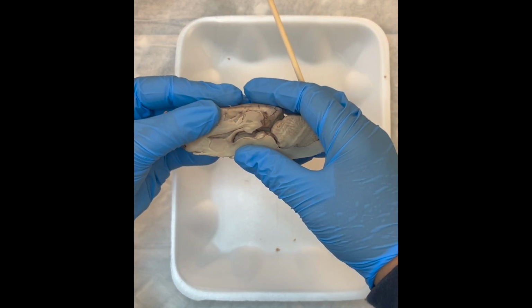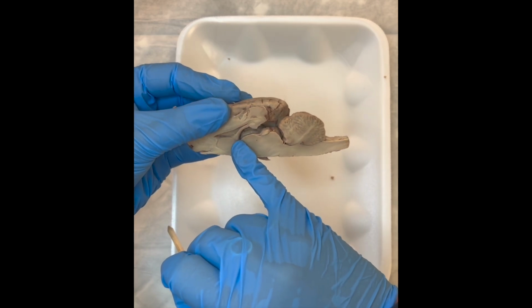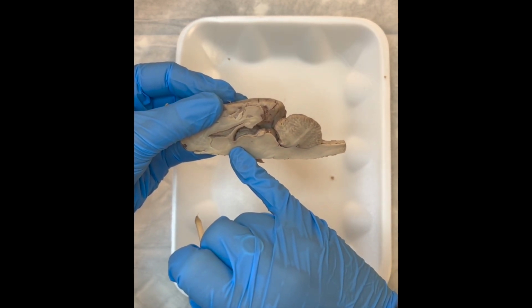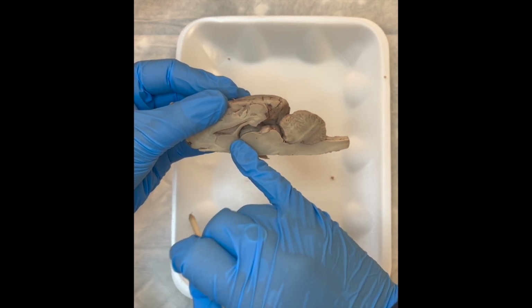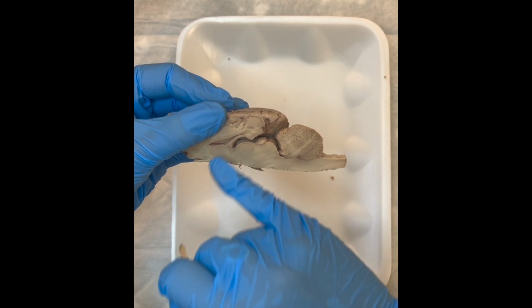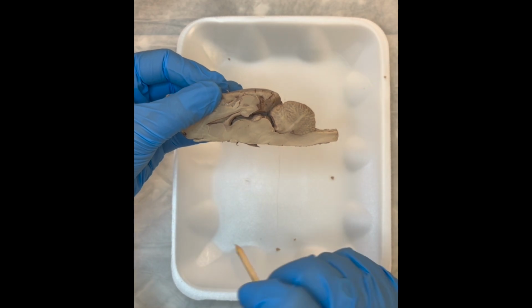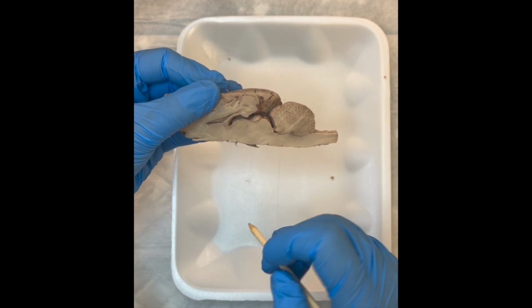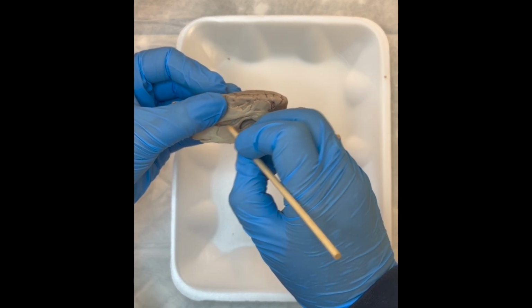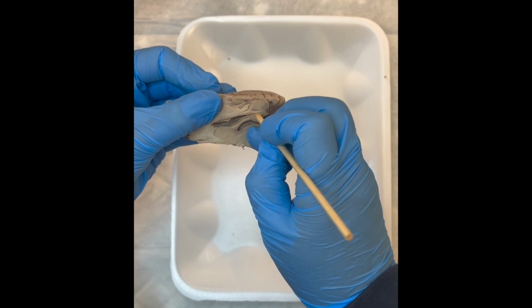Just beneath that, we're going to see the opening into the right lateral ventricle. And as I'm expanding this ventricle here, what I'm noticing is that there's some septum pellucidum left there. That's a thin membrane that separates the left and right half. And when I cut down the longitudinal fissure, I kind of favored the left side a little bit, so more of the right side of the brain was left intact. So I'm going to use my probe and actually just separate that septum pellucidum, that thin membrane.